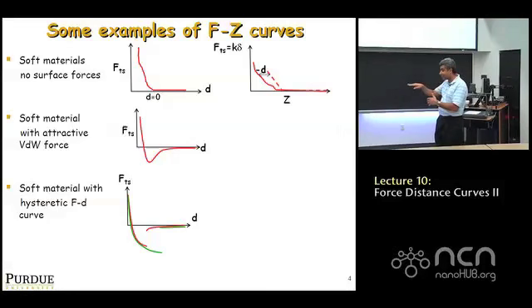In the ideally stiff case, it just has a slope equal to cantilever stiffness, right? So this is the curve in the ideal case. If it's a soft material, it starts at the same point, but lags behind a little further. And the difference is basically the indentation.